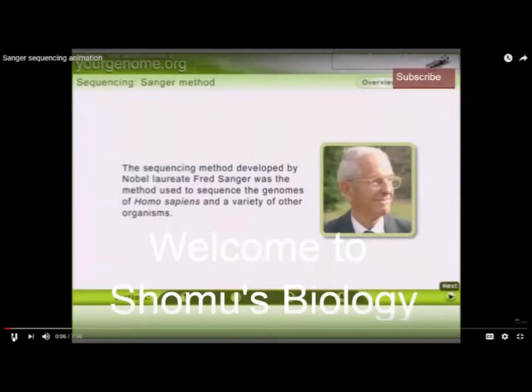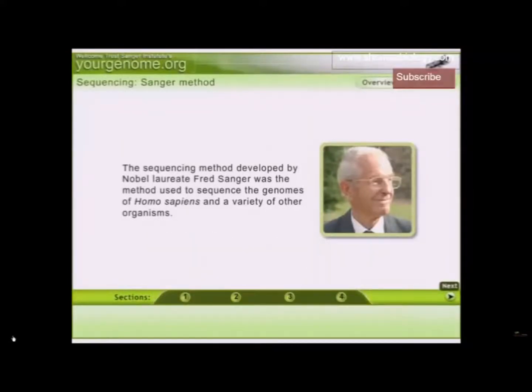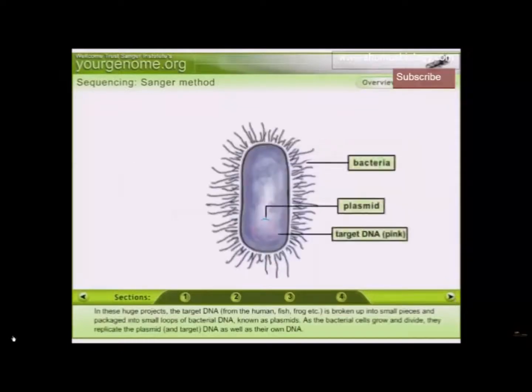Welcome again, friends, and this particular video will be talking about the Sanger method of DNA sequencing. Now, the DNA sequencing method developed by Nobel laureate Frederick Sanger was the method used to sequence the genomes for Homo sapiens and a variety of other organisms. Now, Homo sapiens, remind, this is us, right? Human being.